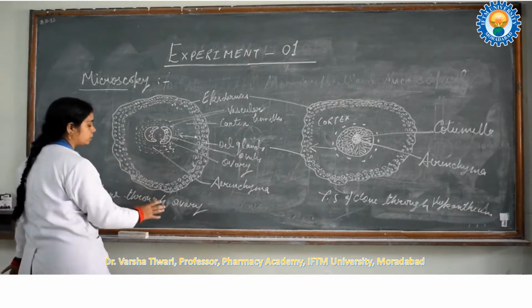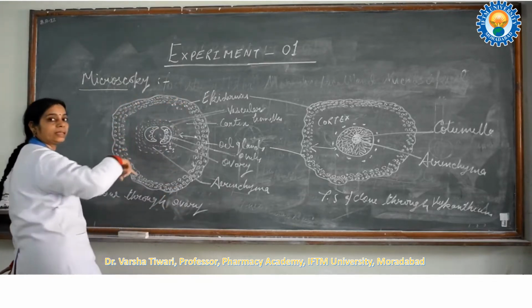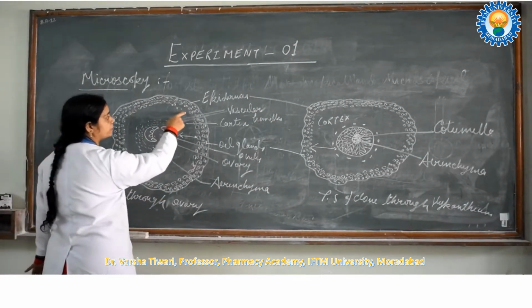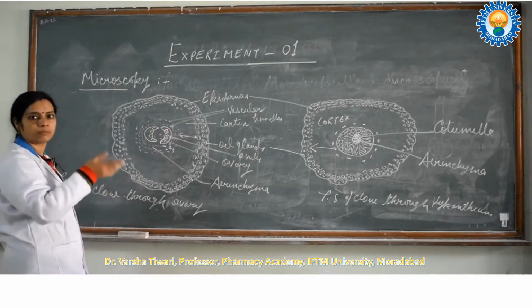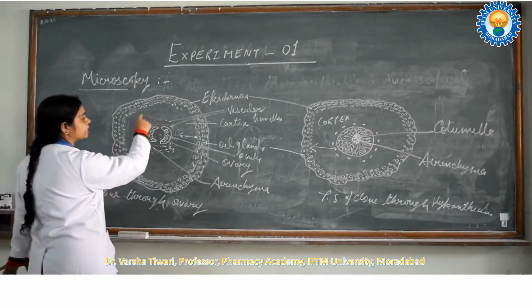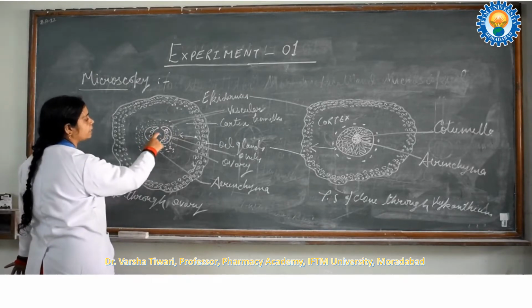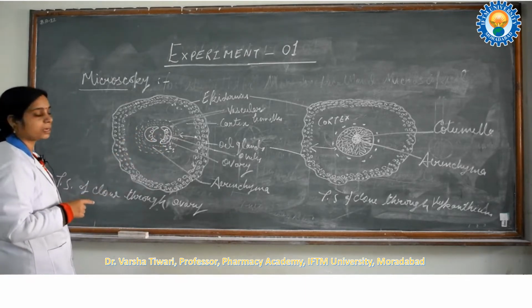So in the section through the ovary, you are going to observe the epidermis and oil glands. In the oil glands, oil is present. Clove contains at least 15% of clove oil. After that, this region is not blank. This region is called the cortex. Cells are present, but we have not shown them because they are the usual cells. The special ones are the 3 concentric layers of vascular bundles above the ovary, and in the ovary ovules are present. This center portion is not blank either. Cells and tissues are present here also.